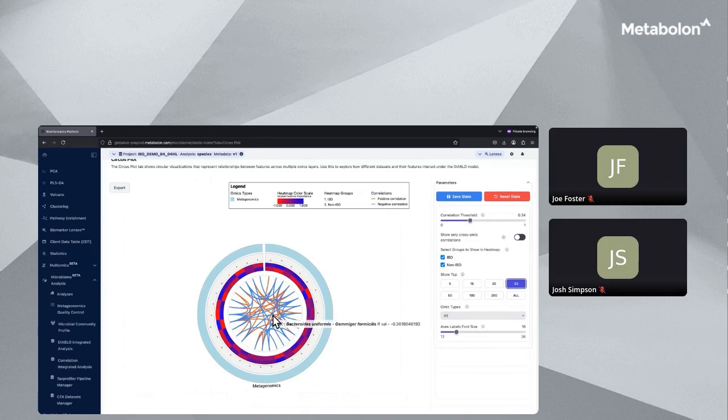If you're interested in only viewing the strongest correlations, we can use a slider on the right to define our correlation threshold, and we can also explicitly filter our plot to only show the top N associations. Here, doing so highlights that Bacteroides ovatus is negatively associated with the commensal E. ramosum species. This suggests that these may be competing taxa in the gut, and that the ability of Bacteroides to diminish the presence of E. ramosum could contribute to its dominance in IBD populations. The discovery of this relationship can also serve as a primer for you to generate new hypotheses for downstream experiments and/or mechanistic validation.